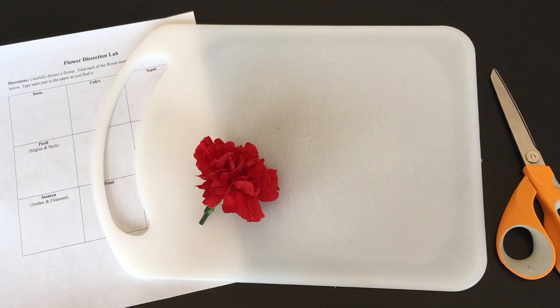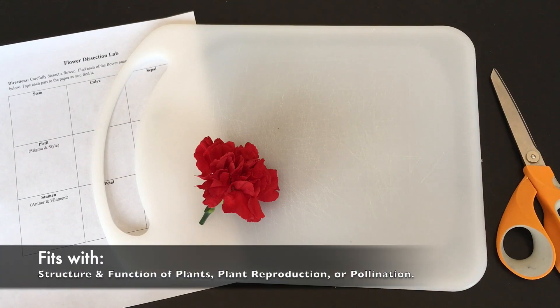Hello everybody! I'm going to show you how easy it is to dissect a flower for a hands-on lab activity. This activity fits great into a unit on the structure and function of plants, or plant reproduction, and it's also a great springboard into the concept of pollination.